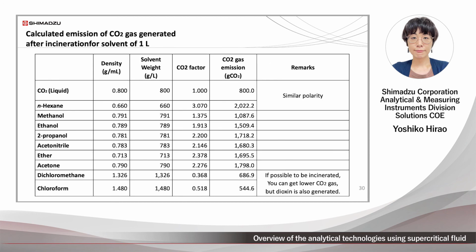Finally, let's review green analytical chemistry again. Here is a reference of carbon dioxide emissions generated during the incineration of 1 liter of the main organic solvents used in the analysis. When organic solvents are incinerated after use, they generate carbon dioxide. However, the material of supercritical fluid carbon dioxide is recycled gas generated in various industries. Therefore, there is no carbon dioxide gas emission.